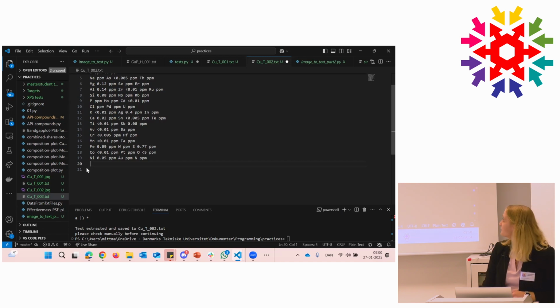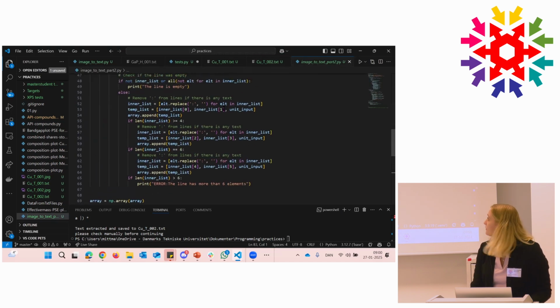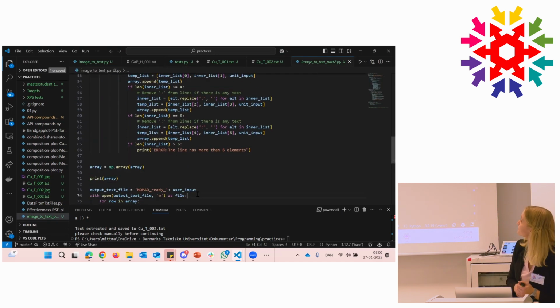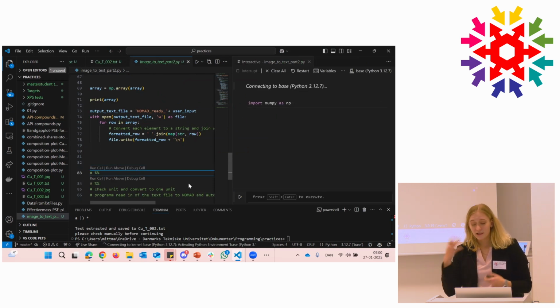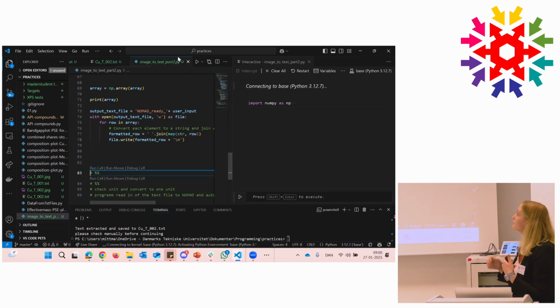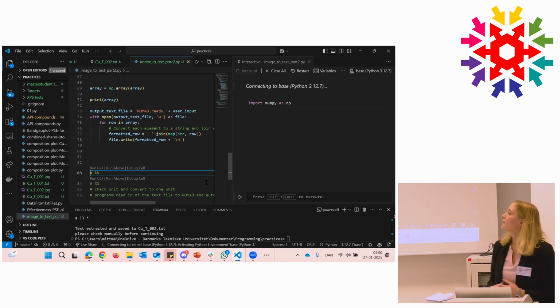Then I can just save these changes and run a little second script on my computer, which will ask me a few questions as soon as it is connected. So it will ask me which material I am looking at, and which supplier it is from, because everyone, of course, formats these things differently.